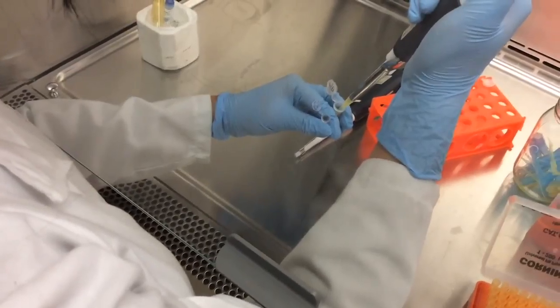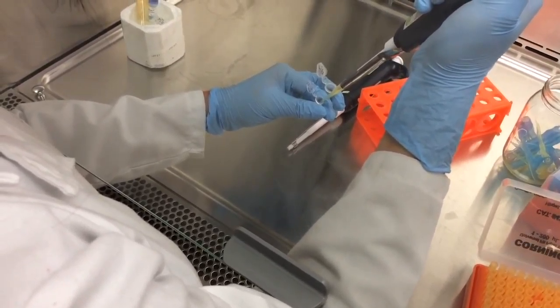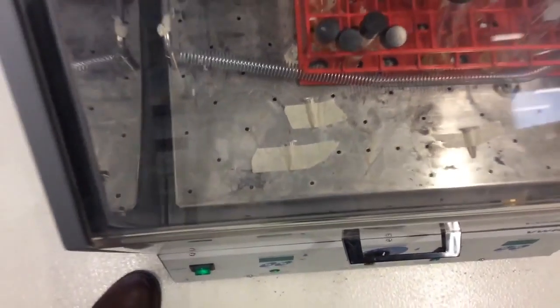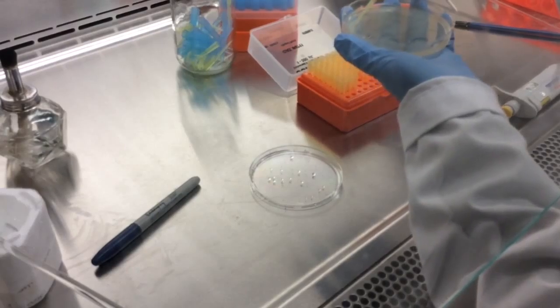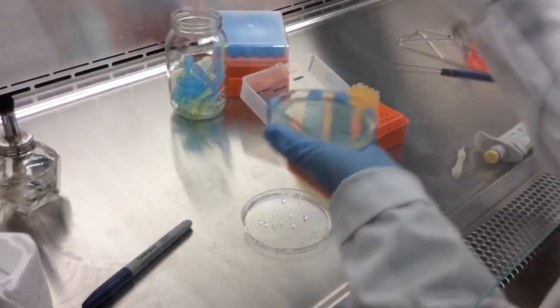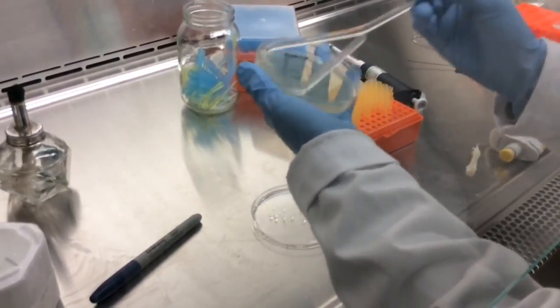After that, transform 3 microliters of ligation reaction into 50 microliters of chemically competent cells. After the transformation, add 300 microliters of SOC medium and incubate at 37 degrees with stirring for an hour. Subsequently, spread ampicillin and X-gal on a plate with LB medium, and finally, seed the competent cells onto the LB plate with ampicillin and X-gal.